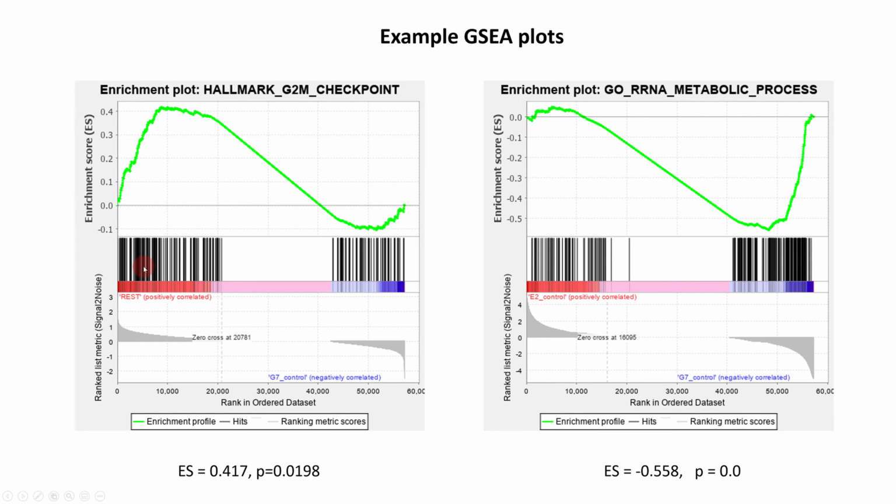So you can see here we have lots of bars on the left. So these are genes which are enriched. These are highly expressed in the experimental sample compared to the control sample. And over here we have another cluster of genes from that gene set. So these are genes that are more expressed in the control sample or are decreased in your experimental sample.